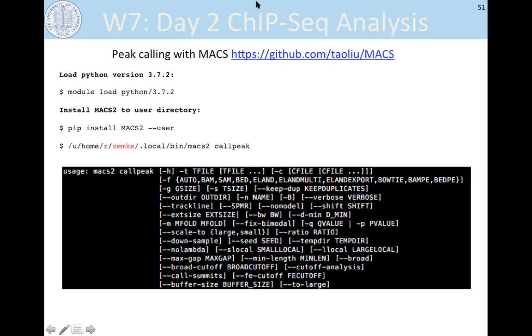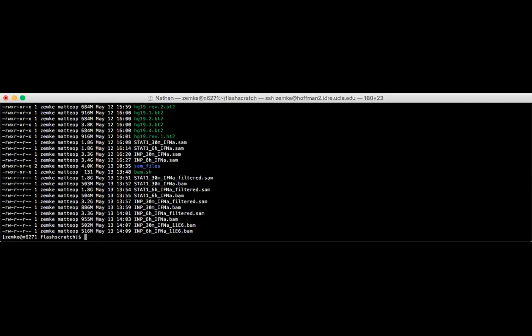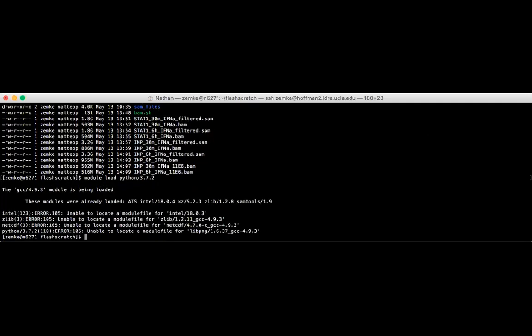So I'll go ahead and do that. Okay. For me, it might give you a couple of errors, but don't worry about that.